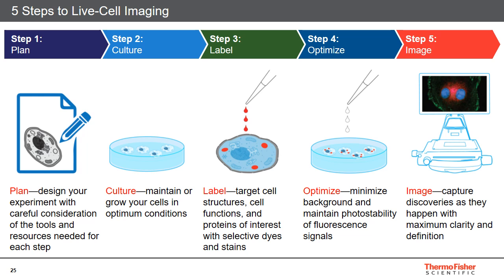So that was a pretty brief overview of some of the different labeling methods, as well as some of the different optimization methods. In the last bit of this talk, I'd like to spend a little bit of time talking about different approaches and considerations when it comes to actually imaging live cells on a microscope.